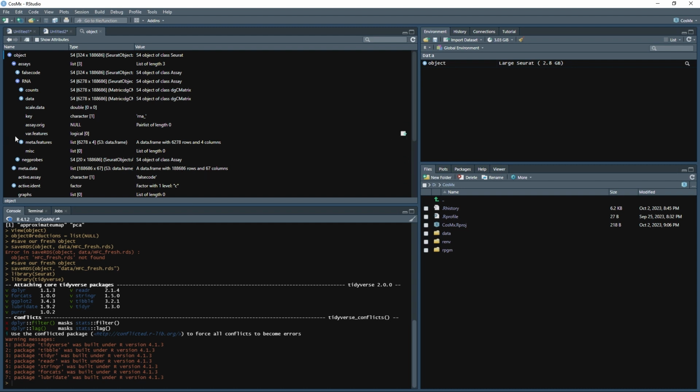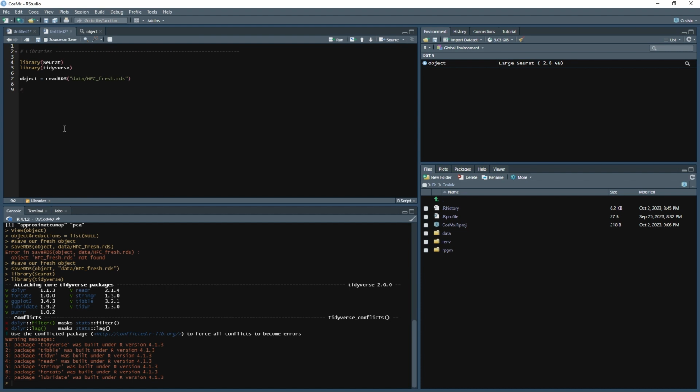I forget exactly which cell types they were, but we want to keep the RNA just RNA. In order to do that, it's actually really easy. So let's check false codes and negative probes, NegPRB, in the RNA experiment, RNA assay.